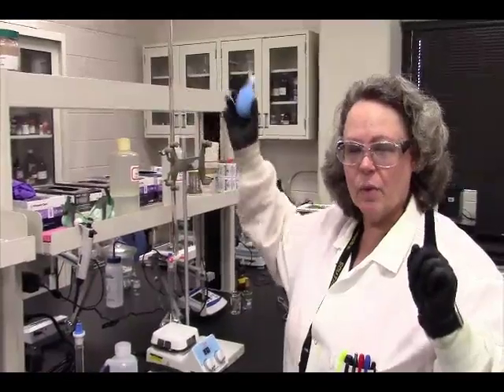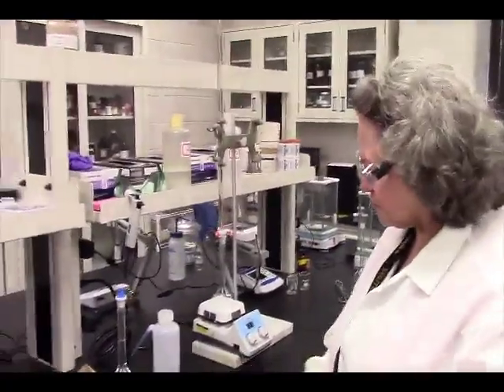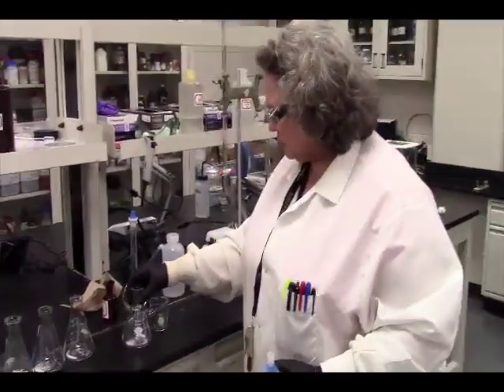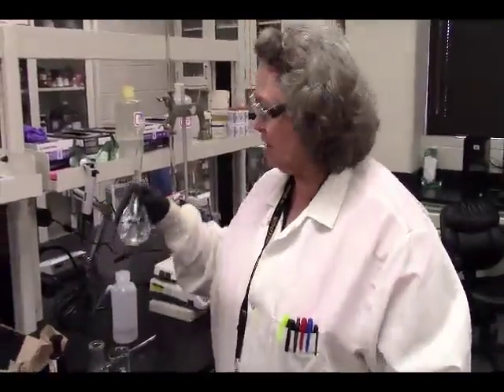This is, by the way, a redox titration. And so the math for that can get a little complicated, and we're going to go through the math after we go through one of our titrations for standardization. So in here, we have some KI. To this, we're going to add a known amount of potassium iodate.